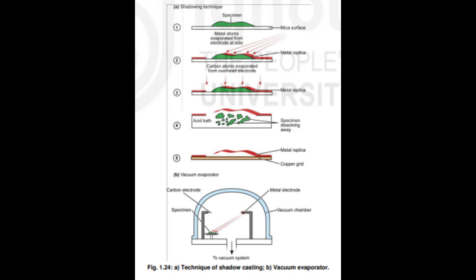The discovery of the microscope has proved a milestone in the study of cell biology, as minute structural details and major cellular mechanisms could be revealed by this technique. Initially, the light microscope proved very useful in studying the structural details of cells, though its lower resolution, 200 nanometers, restricted the study of detailed cell architecture.